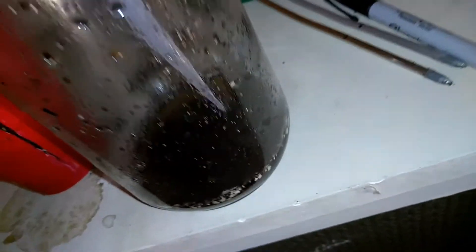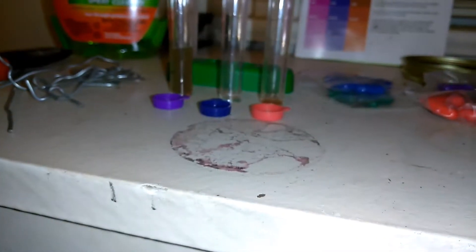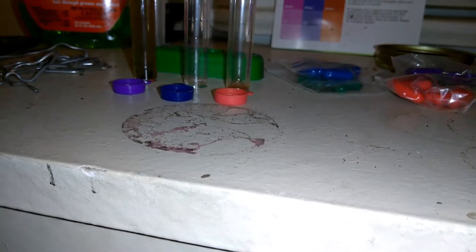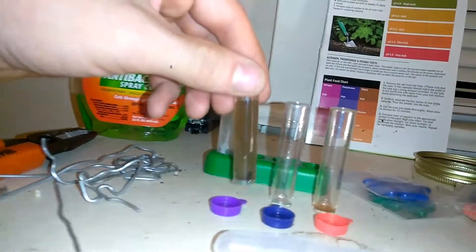Grab your little beaker, stick it in there like so. Gently fill the little beaker up with the solution. And do what the instructions say — fill up to the fourth line. Each one of these. That's the fourth line right there.